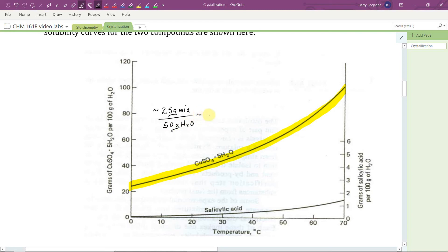We combined that with 50 milliliters—that's approximately 50 grams of water. So that is equivalent to about 5 grams of mixture per 100 milliliters or grams of water, and if you look at our solubility table here, that would occur right around here somewhere.